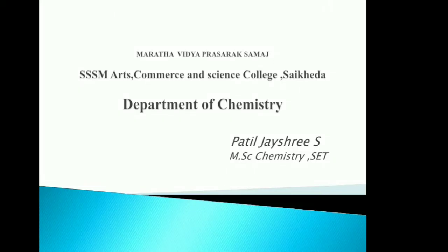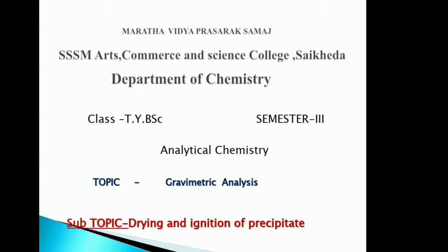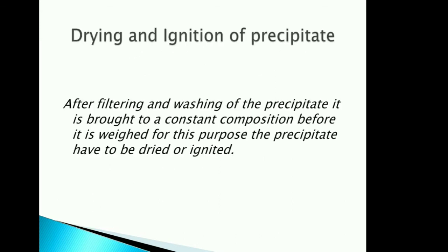Good morning, student. Today we study the process of drying and ignition of the precipitate. This process is very important in gravimetric analysis. So let us begin with the drying and ignition of the precipitate.